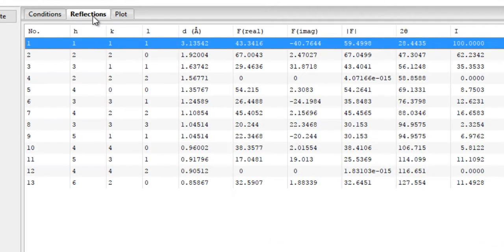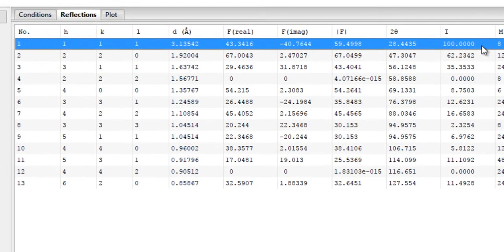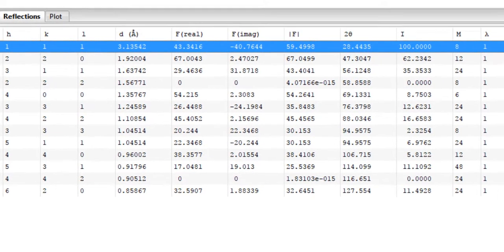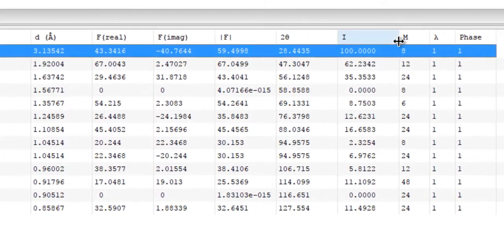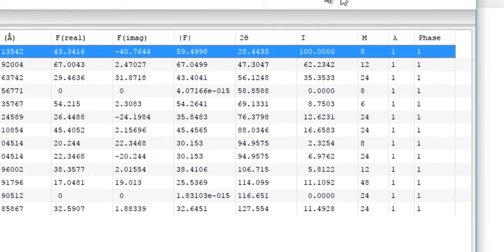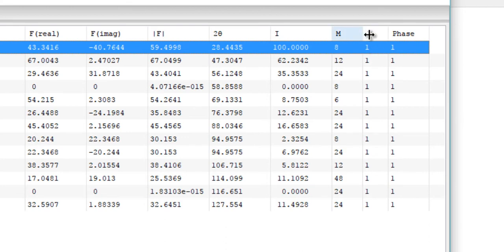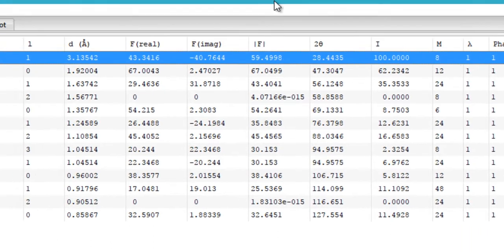Then you have the multiplicity, which is another very important part of your powder pattern, a very crucial information. And then you have the wavelength, I'm not really sure what this means, and then you have the phase.